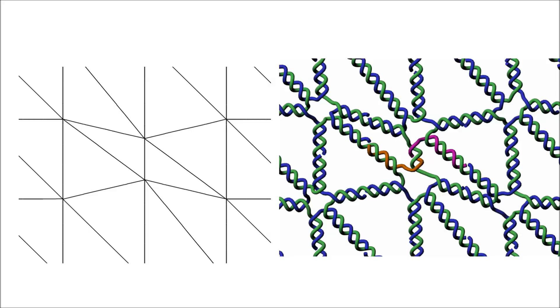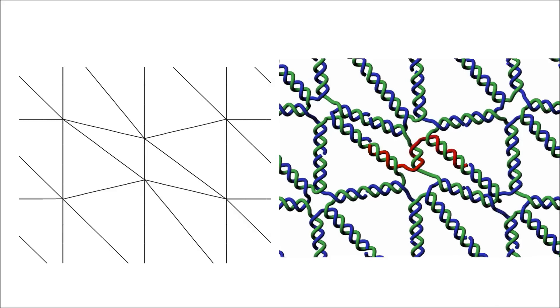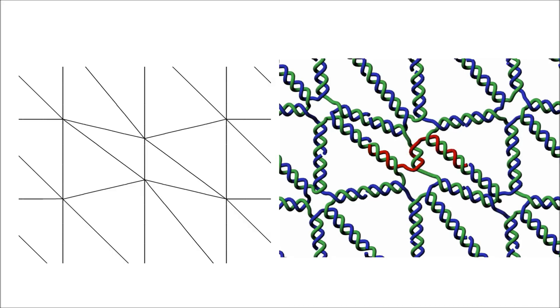So one way to overcome this, is to actually remove the breakpoint separating the two staples on the short edge, and connecting them into one longer staple. So this long staple will instead hybridize to three edges instead of two, and have long binding regions on each edge.